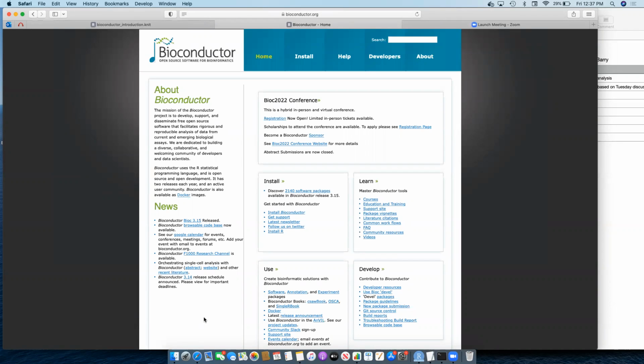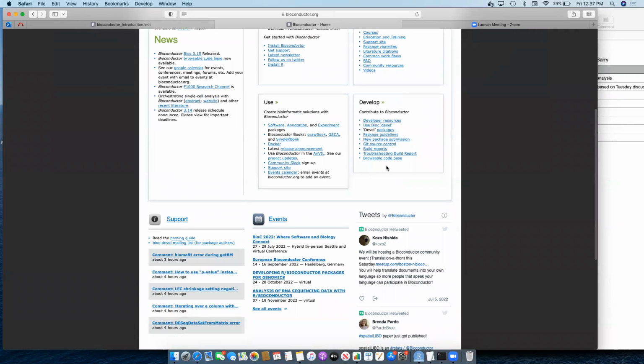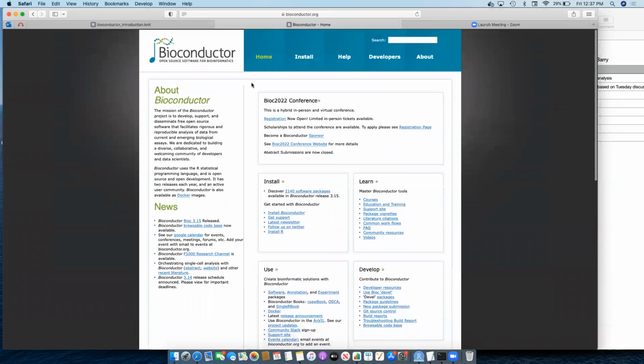Okay, here we go. This is Bioconductor. You can see the homepage and various information here on their conferences, but importantly, information on how to install, how to learn to use it, courses, educational material, including some of our material up here from when we've been to Bioconductor, and then tools for people who want to develop their own software. Now, we're not going to cover any software development here, but if you wanted to, have a look here, and we're happy to discuss.